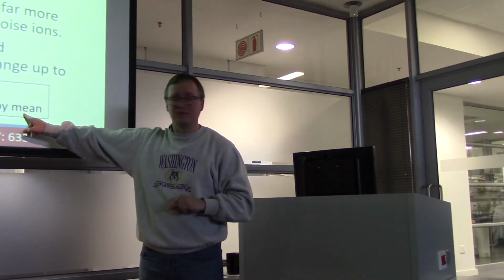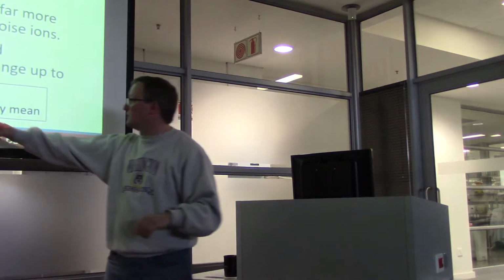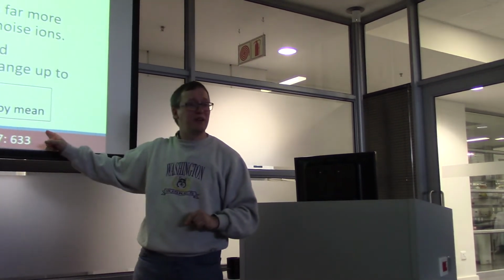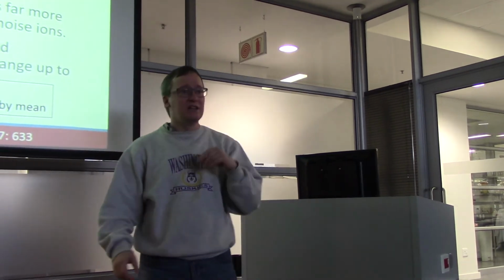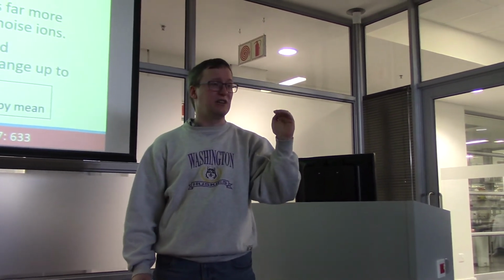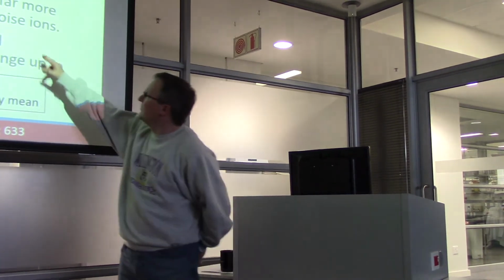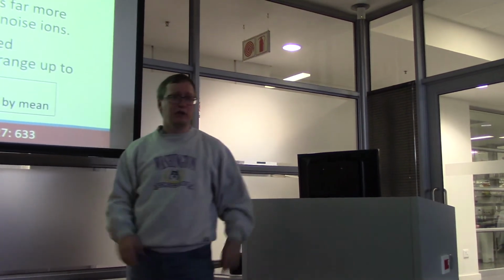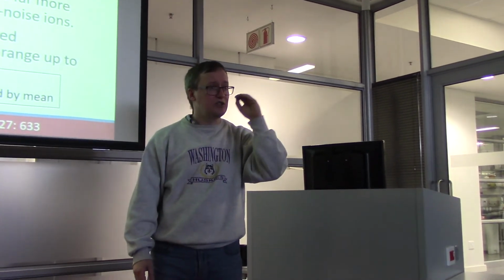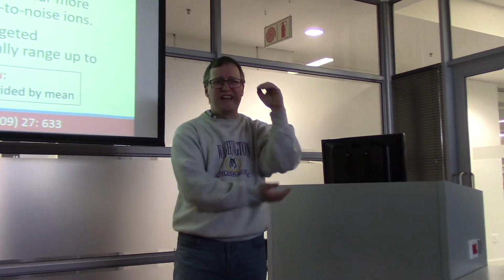CV is coefficient of variation. Having measured the same thing many times, we ask what is its standard deviation, and we divide that by the mean. So when you see a 10% CV, that's a measure of something that's pretty good, in analytical chemistry at least, for quantifying a level. So we're not particularly good at getting strong bounds on our intensity variation when we're down in the noise.